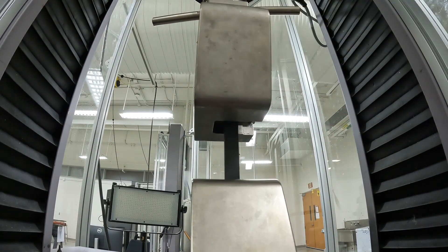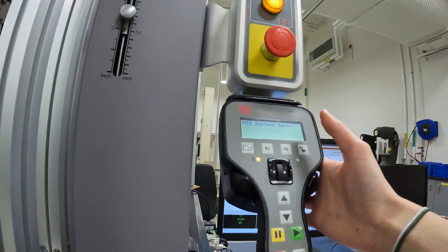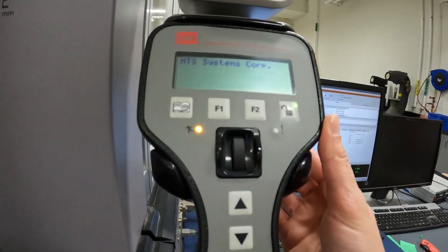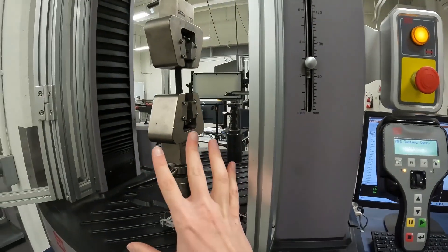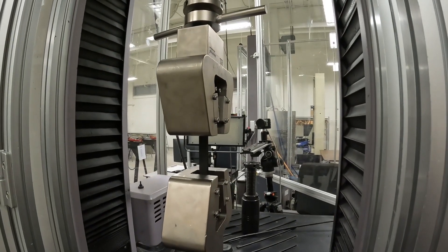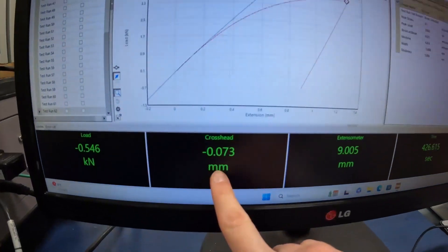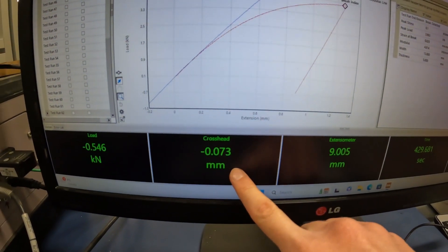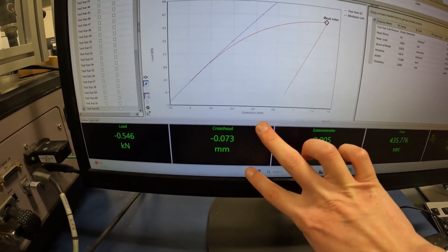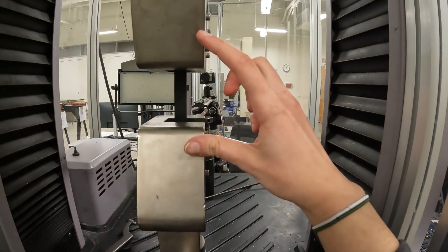For this crosshead, because I tested the sample previously, it's actually higher than I want it to be. So I go back to the machine controller and hit this button, which allows me to control the system using the up and down controls. I hit down so that the top crosshead moves down. I use this crosshead reading to gauge my reference — before every test I zero it so I can see the distance the crosshead moves and figure out how much I need to move it down.